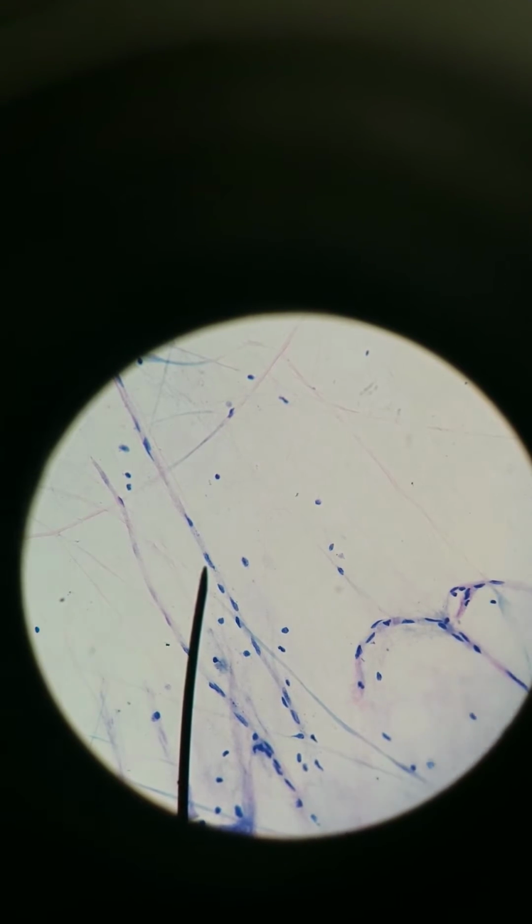So if it's an interneuron, a neuron which is entirely within the spinal cord, then these are oligodendrocytes. If this is a motor neuron whose cell body starts in the spinal cord but then extends out of the spinal cord, then these would be Schwann cells. I'm actually inclined to say Schwann cells because you see tons of nuclei that line up all along the axon, and you would see more nuclei if there were Schwann cells.